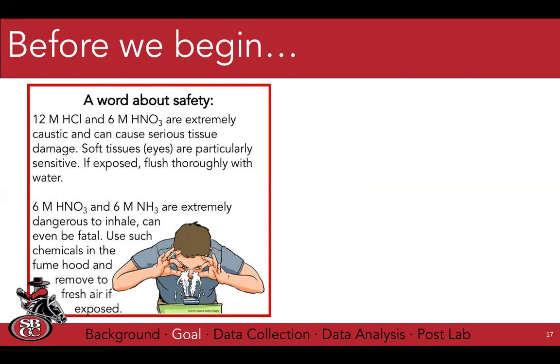If you get it on your arms or your eyes especially, you want to rush to the eye wash stations. We've shown real pictures of what they look like before you enter any lab in any situation. You want to know where these safety locations are and how you get to the eye wash station, because remember, if you've got acid in your eyes, you're not seeing very clearly.